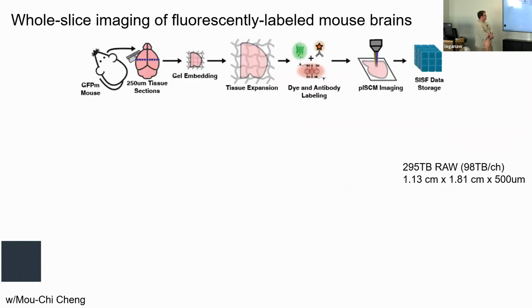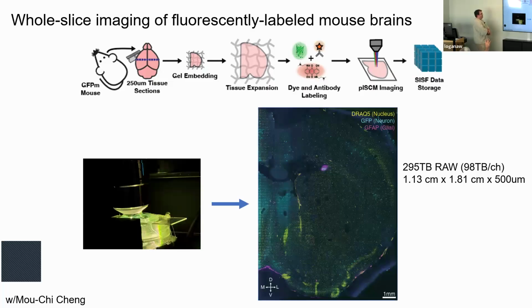So to give you an idea of what this first part of my talk all put together looks like, like I was saying, we loaded up the instrument, and I have this picture just because it looks cool. You can see here this red, yellow, bluish sort of thing. Those are our 3 laser beams that are scanning back and forth inside the sample to do the confocal imaging. So this is what it looks like while it's actually imaging, and it's very bright because they're very bright lasers.